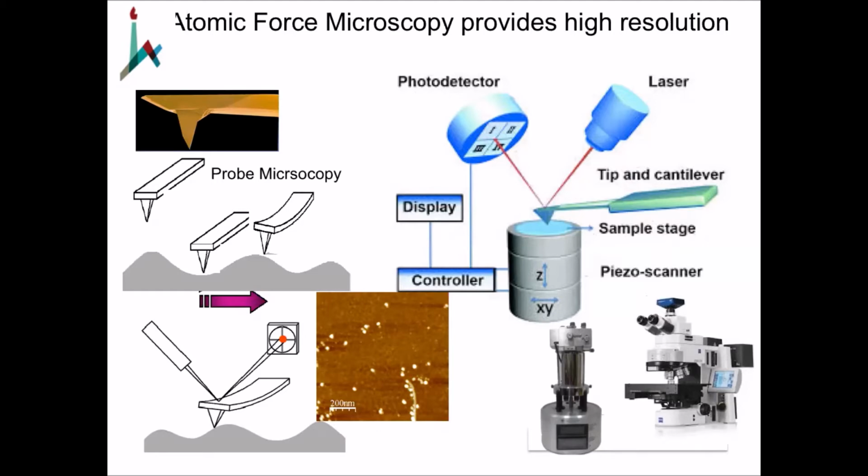But the synergism is much more global than people realize today. And as you will hear at the end of this talk, if you start putting the information you get from these different microscopies together, then you have a chance of achieving even better resolution and better methodologies for resolving the issues of microscopy, which are looking at the optical distribution and the 3D structure, okay?